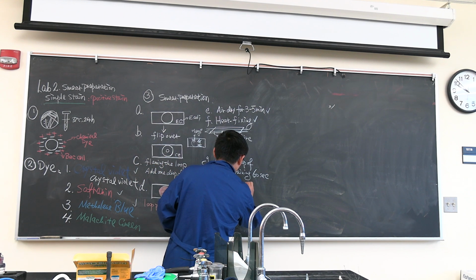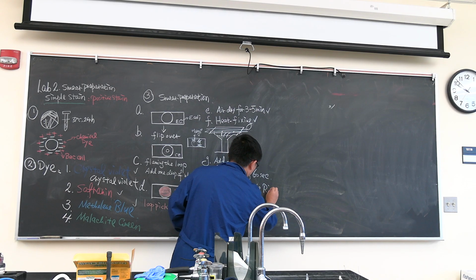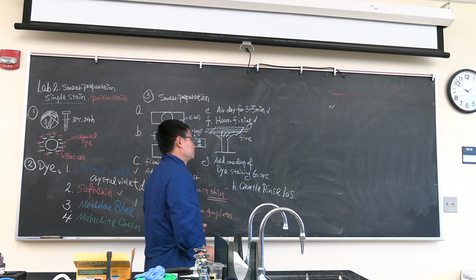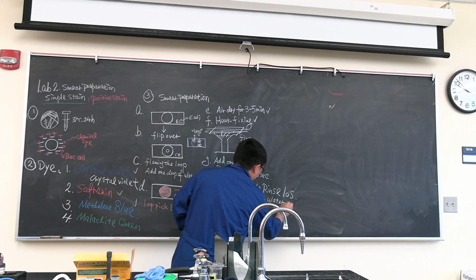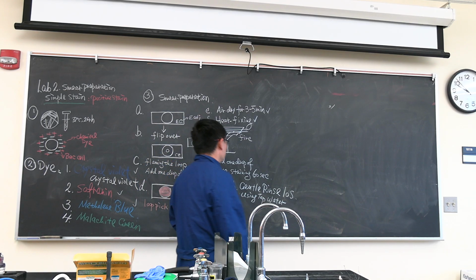Then a gentle rinse, about 10 seconds, using tap water. Not flushing, very gentle. And then we dry a little bit.